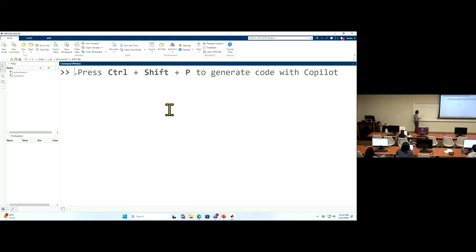5 columns. So for our single cell data, say this is 10,000 by 10,000 as our input, and this rotation matrix will be 10,000 by 10,000, because the rotation matrix is equal to the number of variables you use to describe your samples.